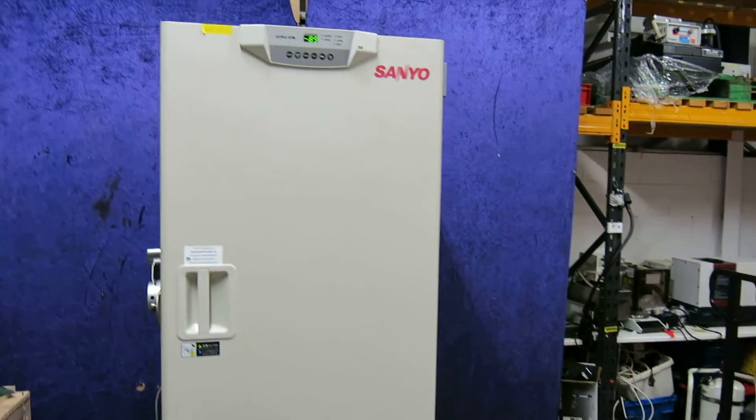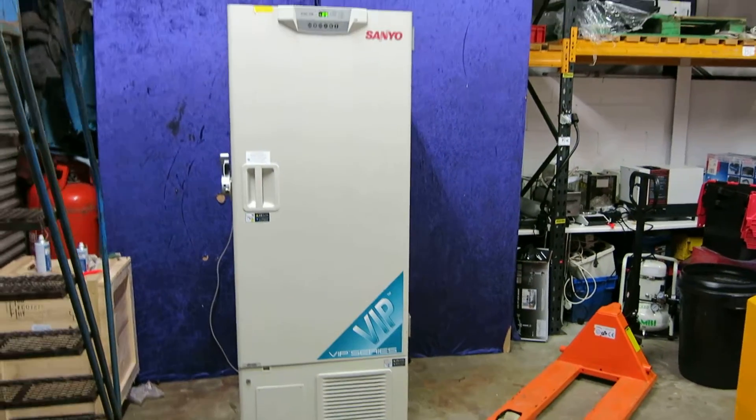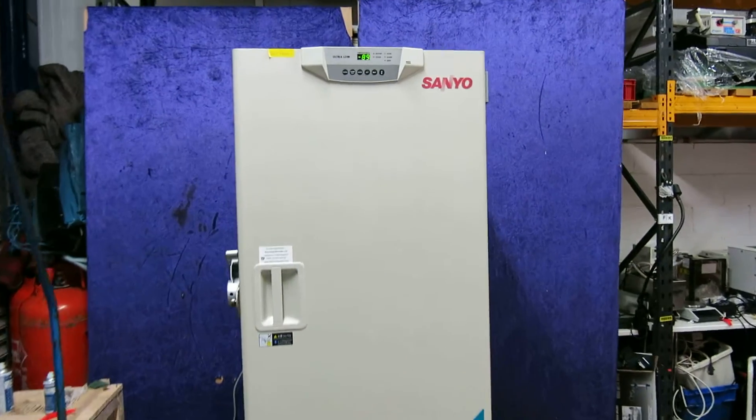Hopefully you've got some sort of an idea as to the size of this particular freezer. I'll just give you an idea there. What I'm now going to do is open the freezer up so you can see the condition of it.